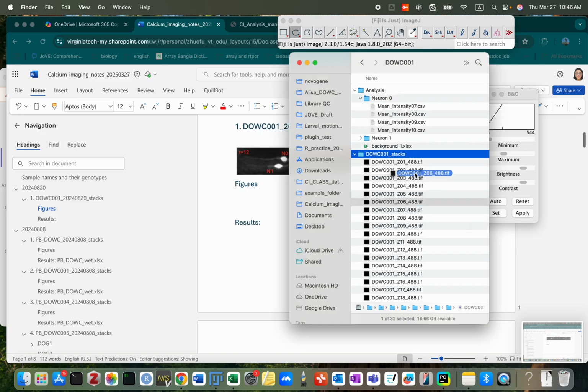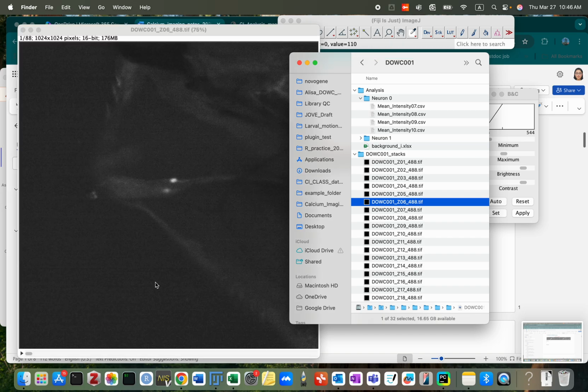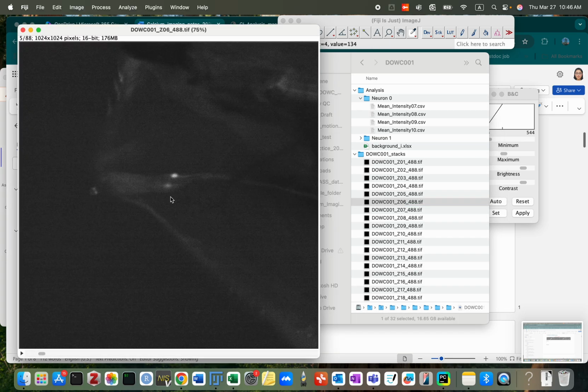6. Double check because otherwise it's going to relate to, and could be checking what's on, or you can just delete it. Yeah, sorry about that.